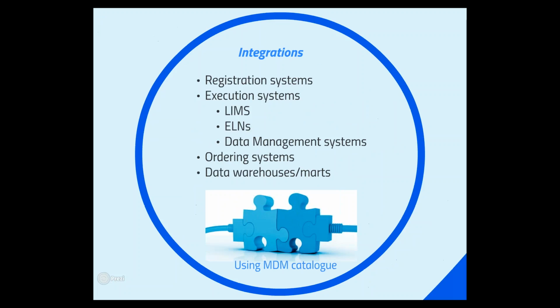In terms of integration, the system is usually integrated with a number of different systems. For example, it will be integrated with a biologics or small molecule registration system, so we can validate that the samples you're submitting actually exist in a system, and we can withdraw some of their properties as well. It's also integrated, as I mentioned, with LIMS, ELNs and data management systems for execution, so we can transfer a unit of work over and then actually record the results in those systems.